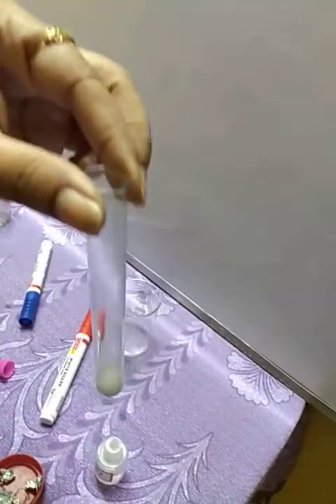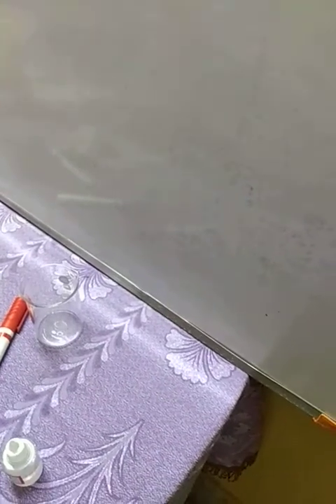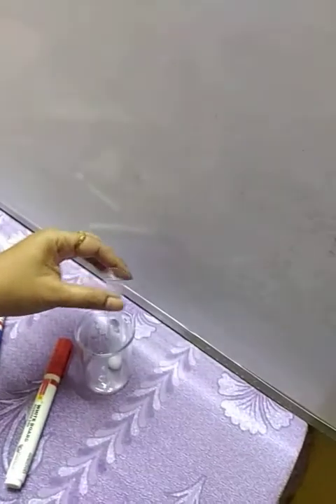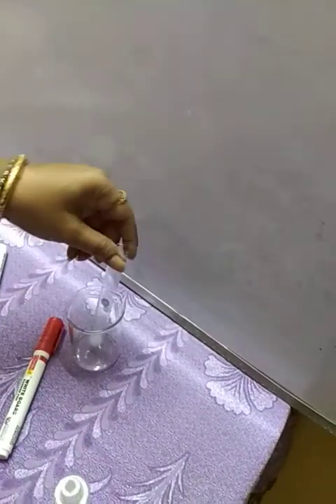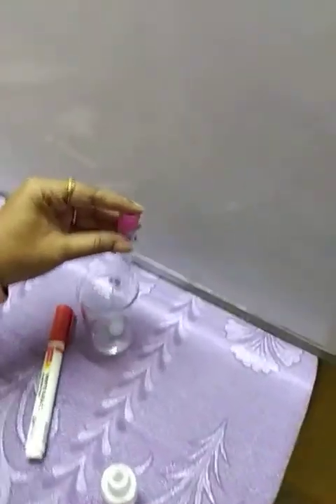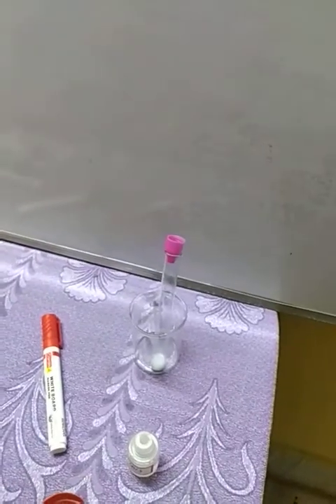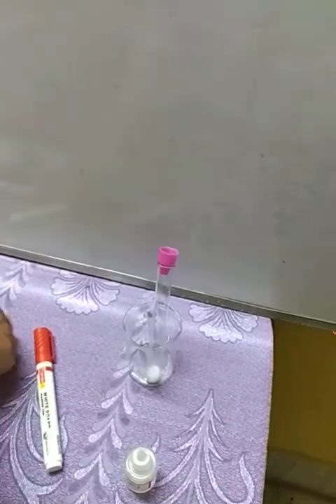Hope you can get the sound of the production of hydrogen also now. This is the sound. I'm keeping it in this manner. This reaction is over, meaning it's already going on actually, but now we will be doing some other reaction. So let it be in this manner.